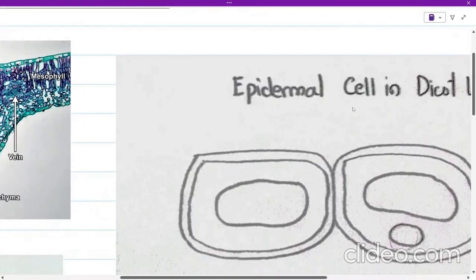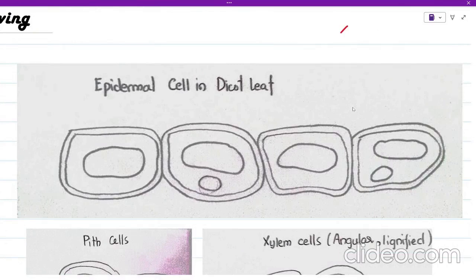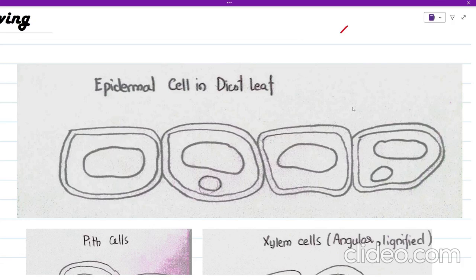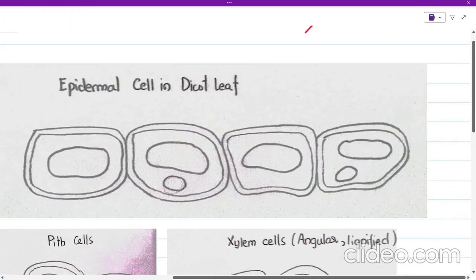This is the drawing I made of the four epidermal cells. You can see I have represented the cell wall with a double lining — whenever any cell contains a cell wall, it must be represented with double lines. Cells that have only a cell surface membrane use only one line for the outer boundary. The double lines represent the cell wall, and the structure in the middle is the vacuole.